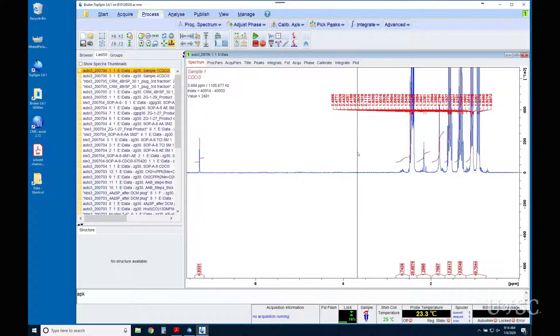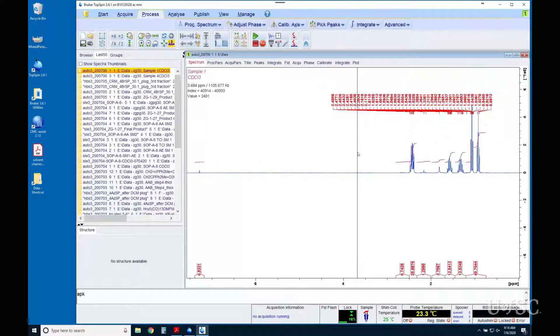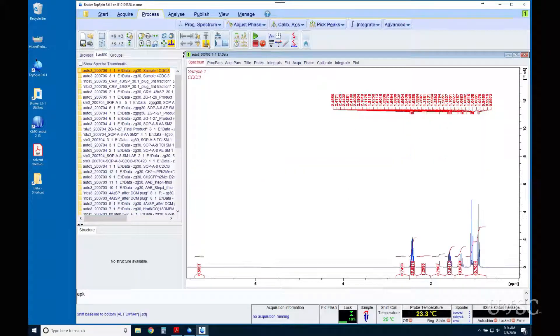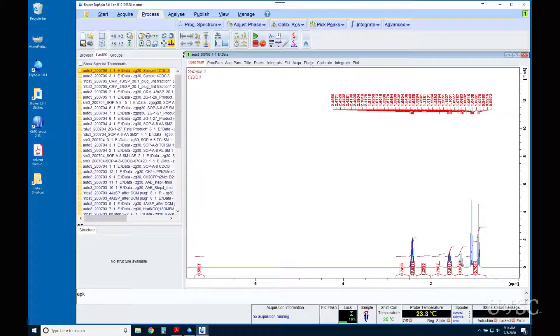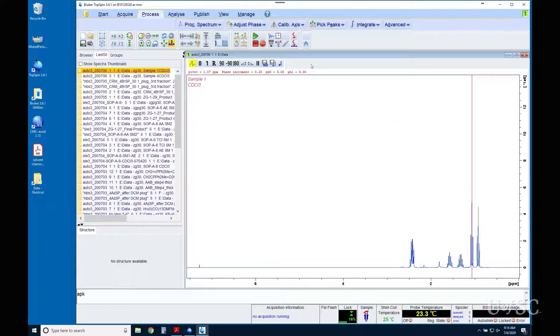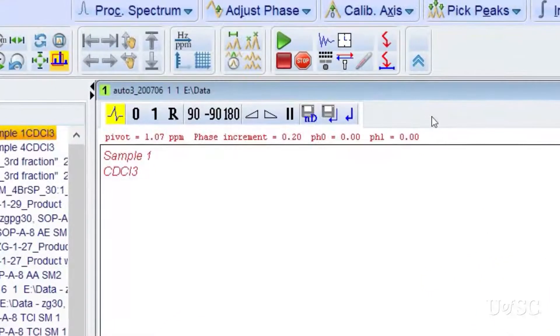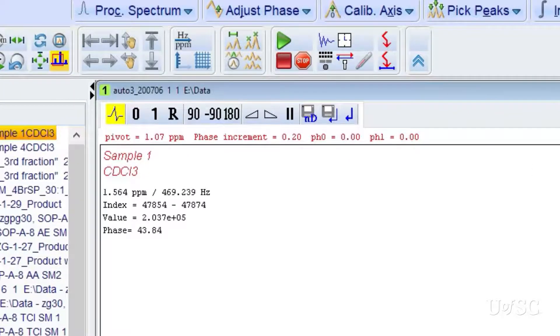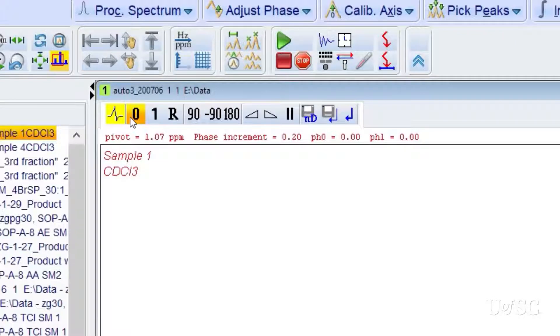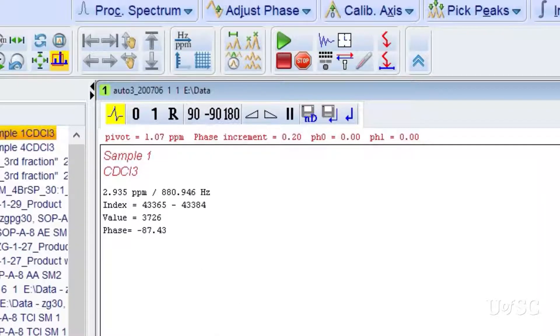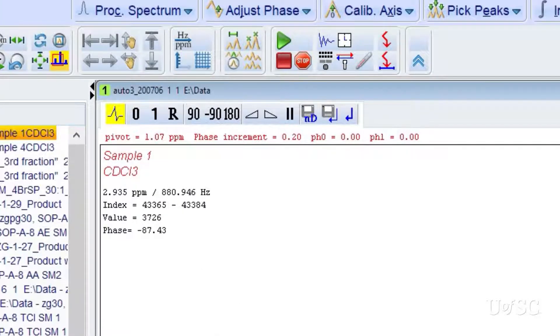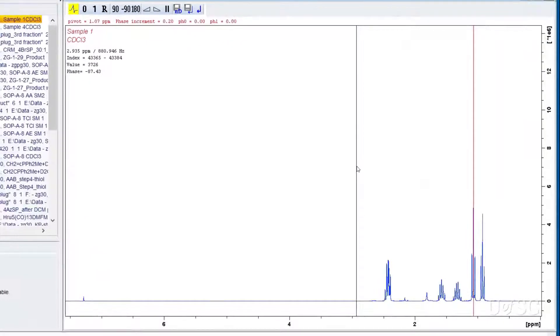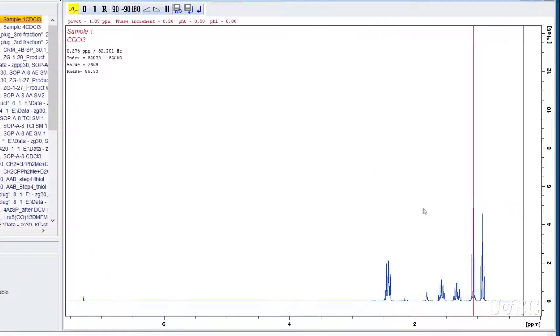To make manual adjustments to the phase you would first find the phase tab on the tab row above the spectrum. Clicking on the phase tab will open the routine. Notice that the tab row is replaced by a series of buttons that are specific for the phasing operation. A complete description of the buttons is in our topspin manual and we will work with a few in this video. The integration and peak labels have been removed from the spectrum to help with the phasing.